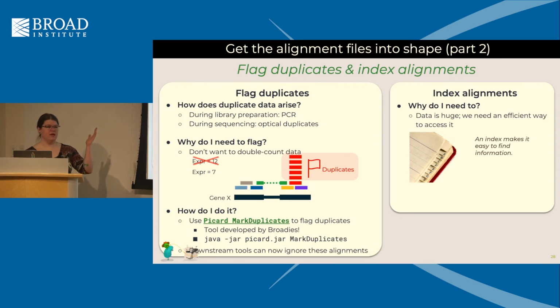And then we've talked about indexing for the genome indices themselves, and so too for alignments of data that you've generated. You need to be able to move through the file rapidly, and thus we need to have an index to move through that file rapidly.